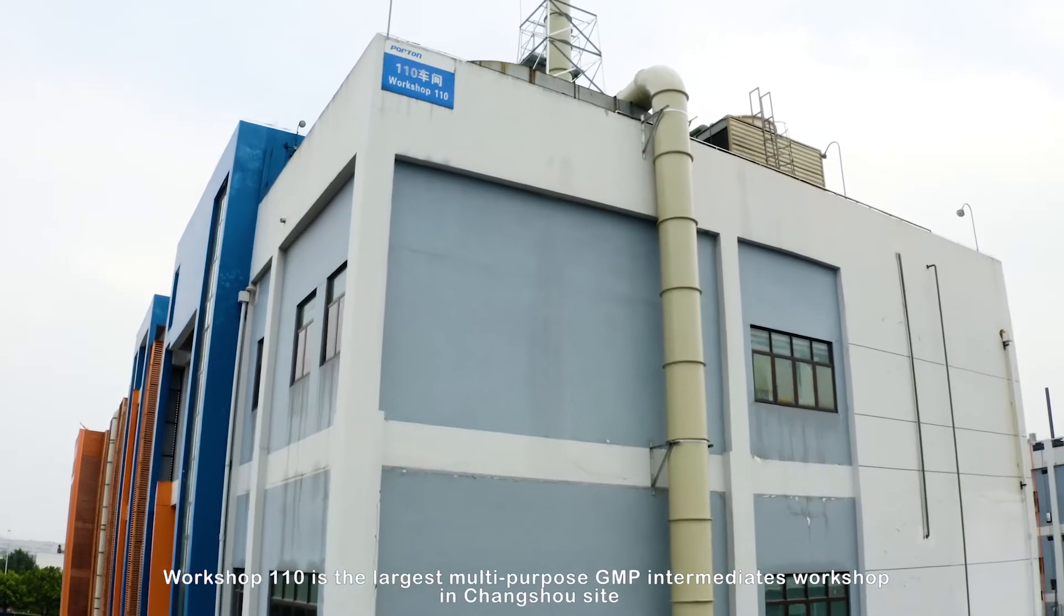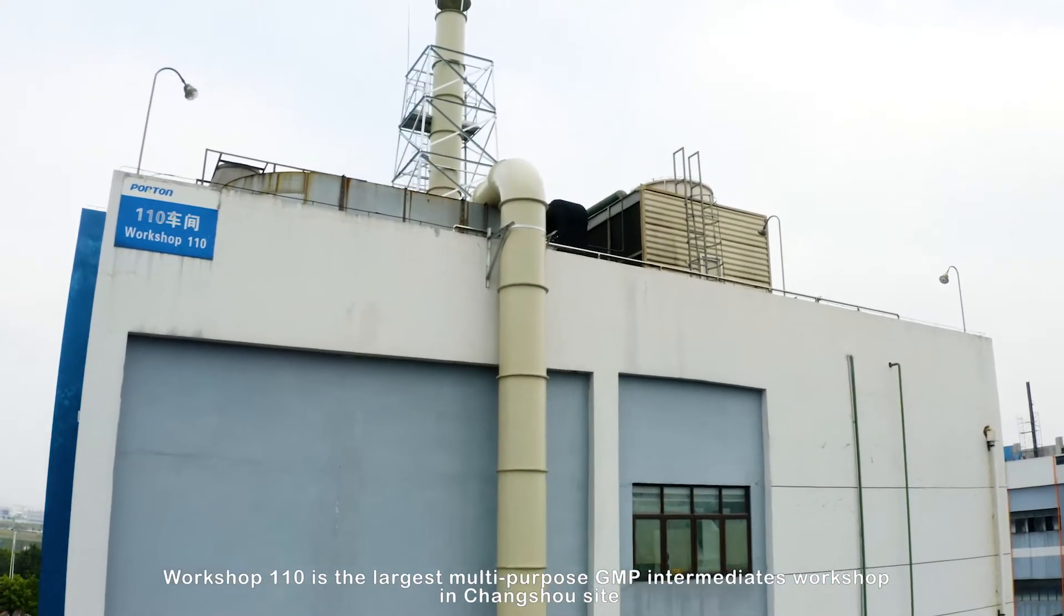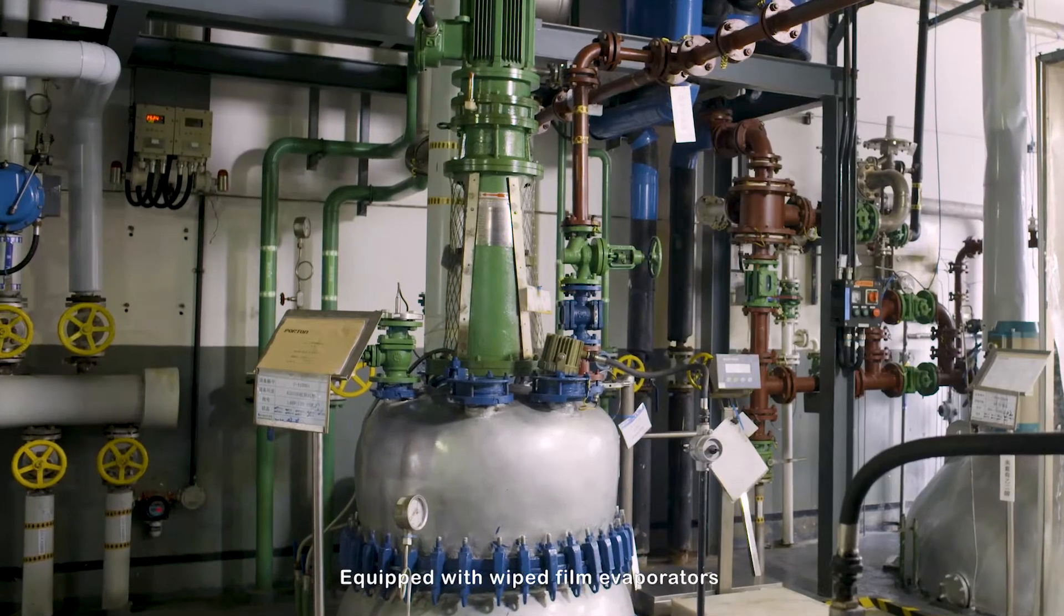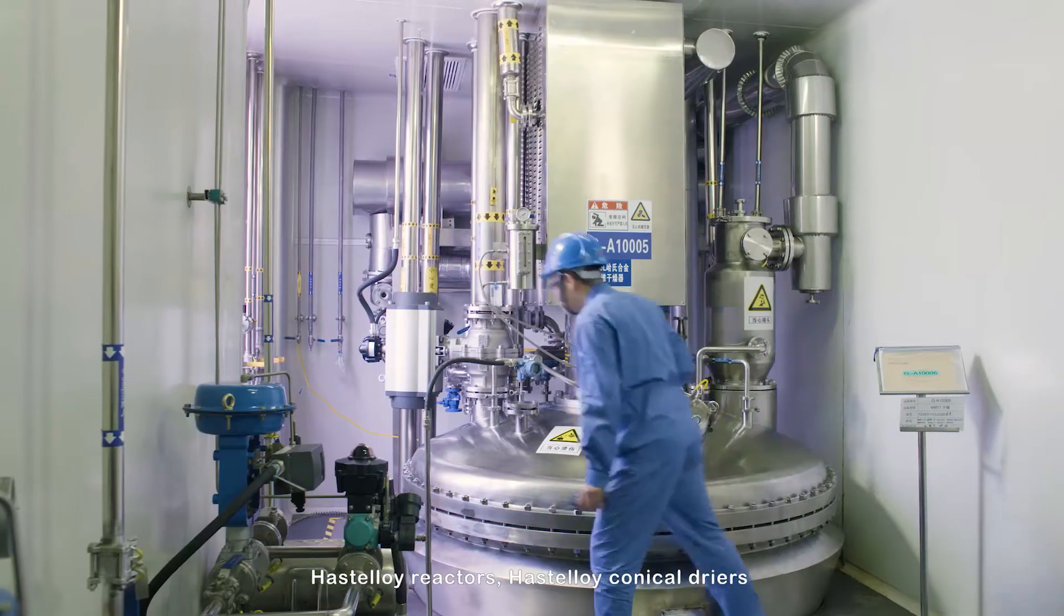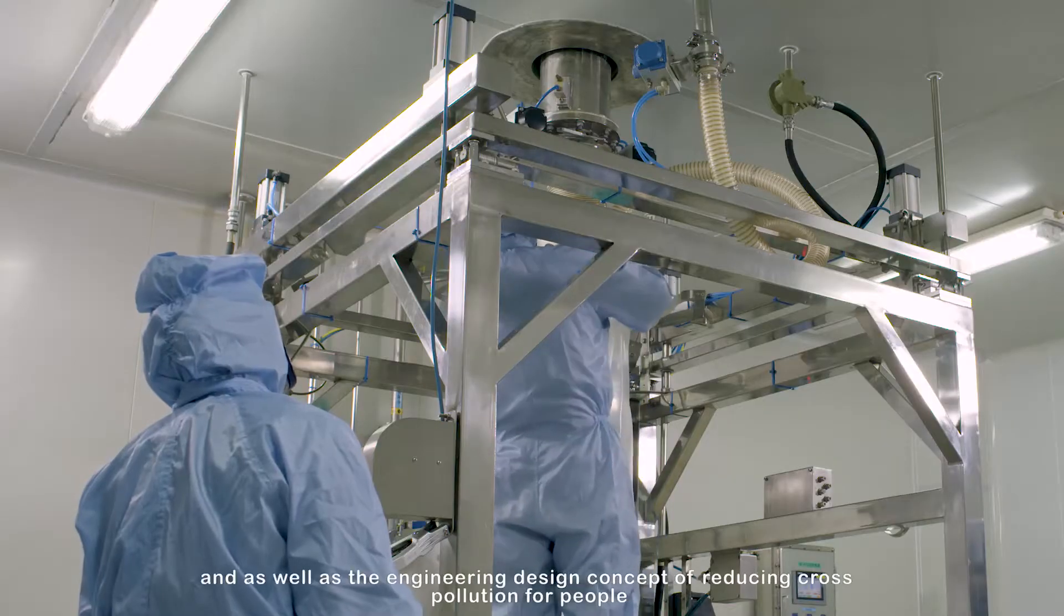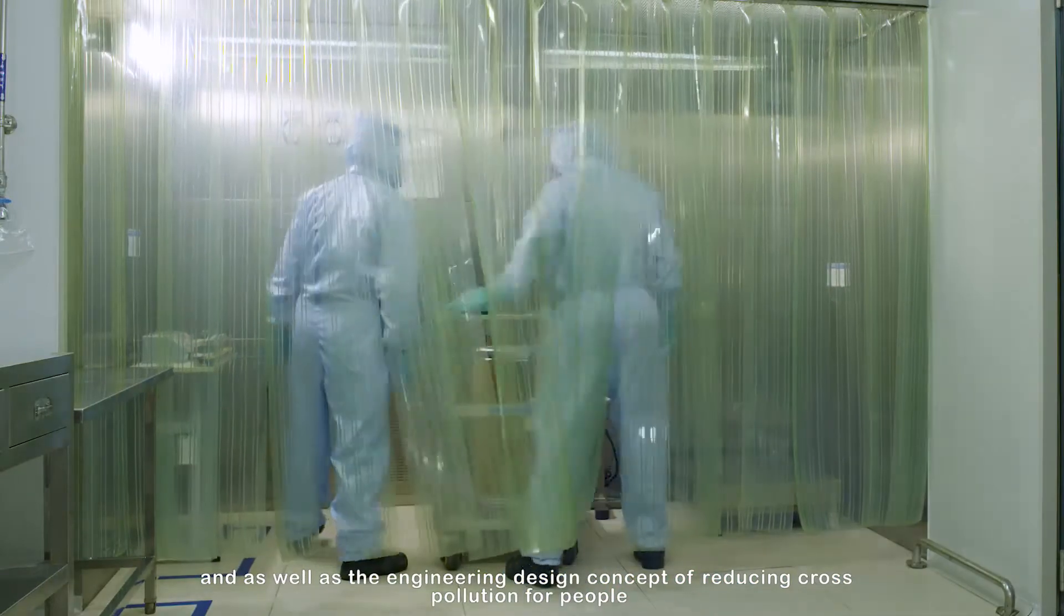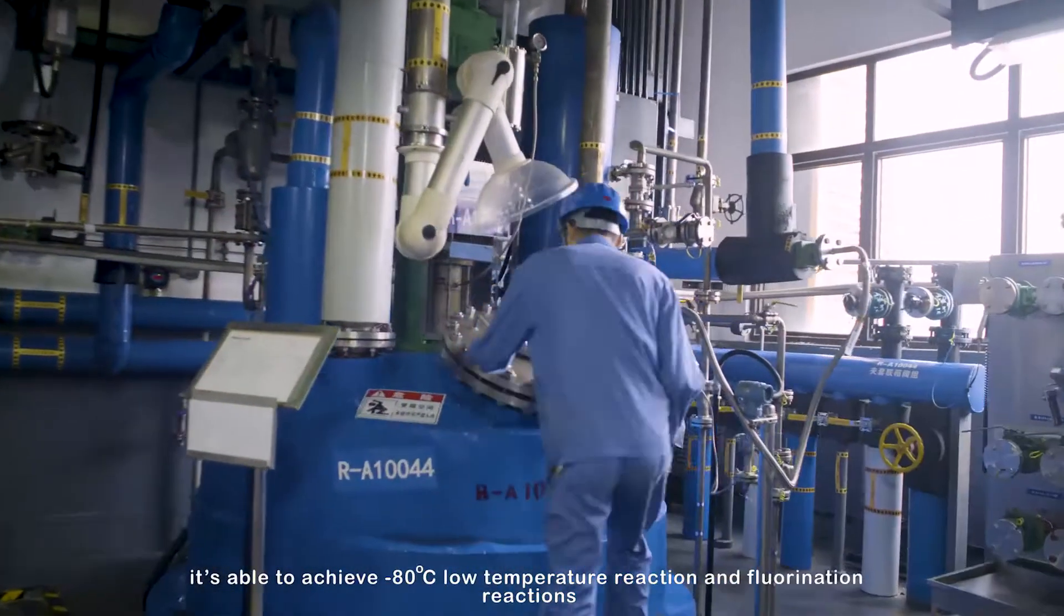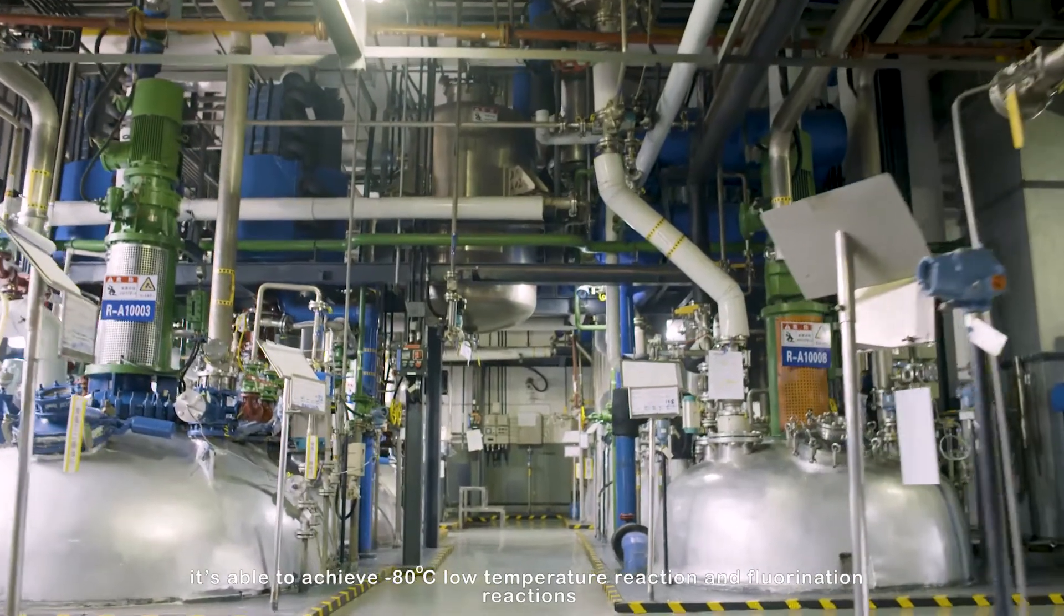Workshop 110 is the largest multi-purpose GMP intermediates workshop in Changshou site. Equipped with wiped film evaporators, hastelloy reactors, hastelloy conical dryers, and liquid material transfer equipment, and as well as the engineering design concept of reducing cross-pollution for people, it's able to achieve minus 80 centigrade degree low-temperature reaction and fluorination reactions.